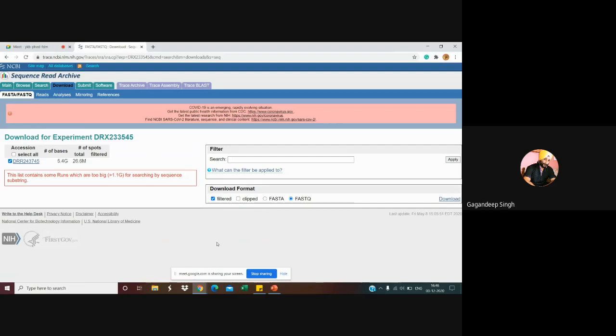After that, we will again filter our reads in NGS because we need accurate data. And how accurate is it? The data will never be 100% accurate, so we'll try to get the accuracy up to 70%. That's why, but this is the data that we are downloading.